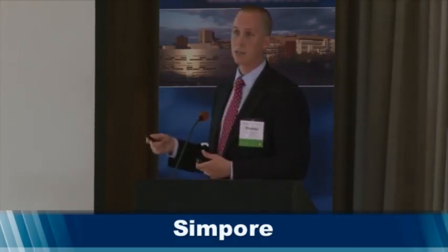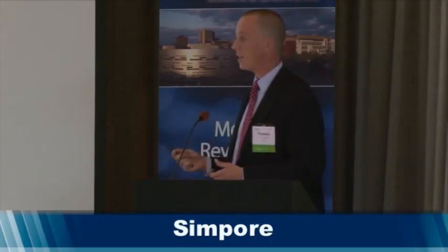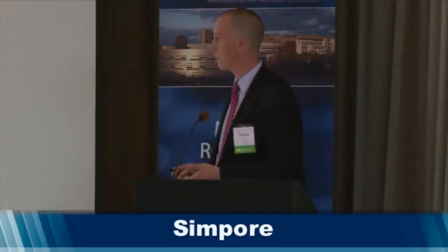If you think about the picture of the membrane on the previous slide, it's very lossy. There's lots of loss there, and it requires larger volumes to do these assays. These assays right now are relatively low throughput. However, the early screening steps are high throughput, and this is really that issue of loss of material due to the membrane.